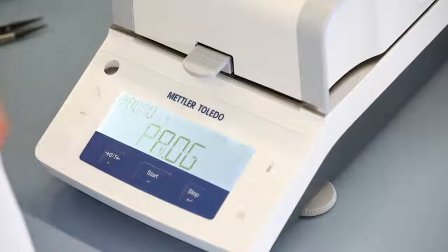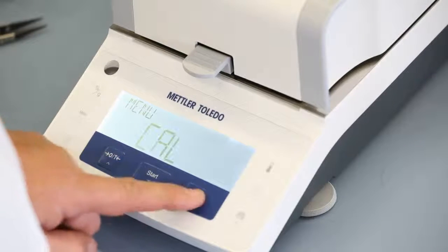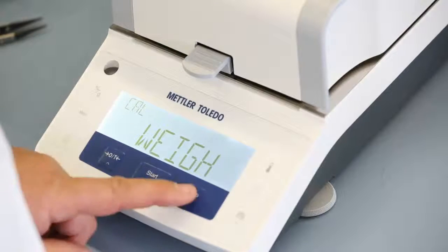To adjust the weighing unit, press the menu button, scroll to calibration and select weight calibration.